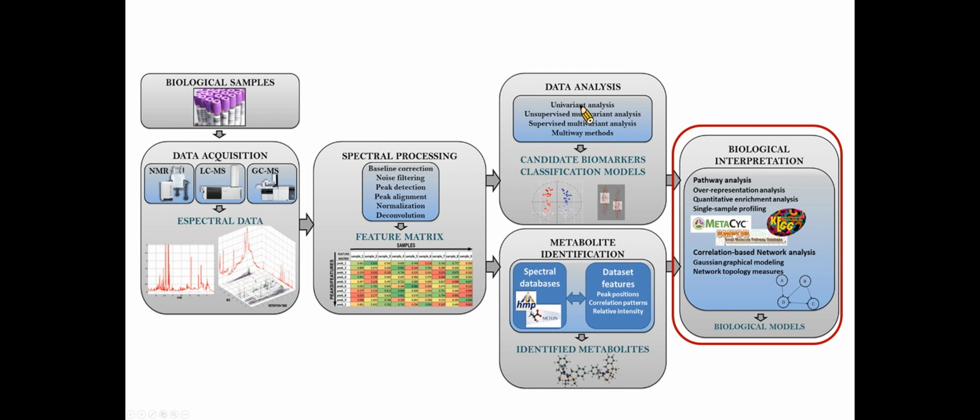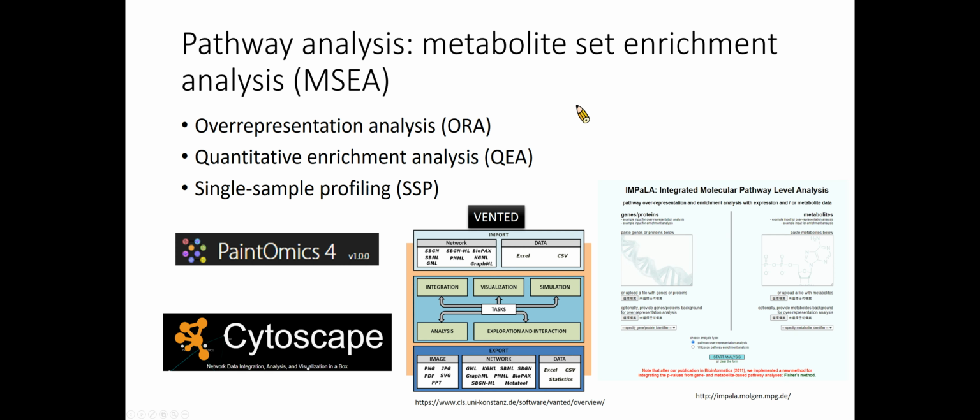Alternatively, network analysis uses the high degree of correlation existing in metabolomic data to build the metabolic networks that characterize the complex relationship existing in a set of major metabolites. Metabolic pathways are groups of metabolites that are related to the same biological process and that are directly or indirectly connected by one or multiple enzymatic reactions.